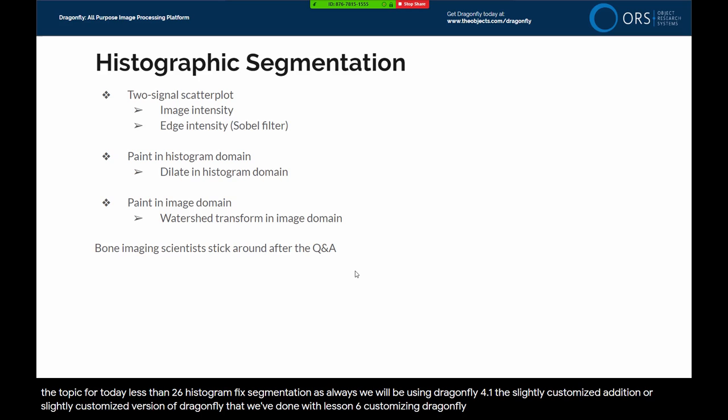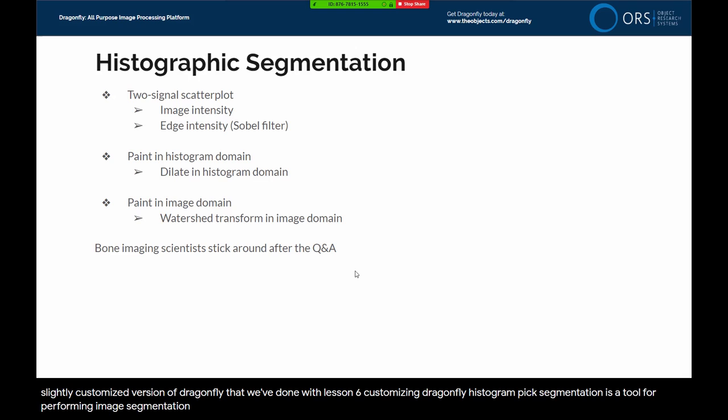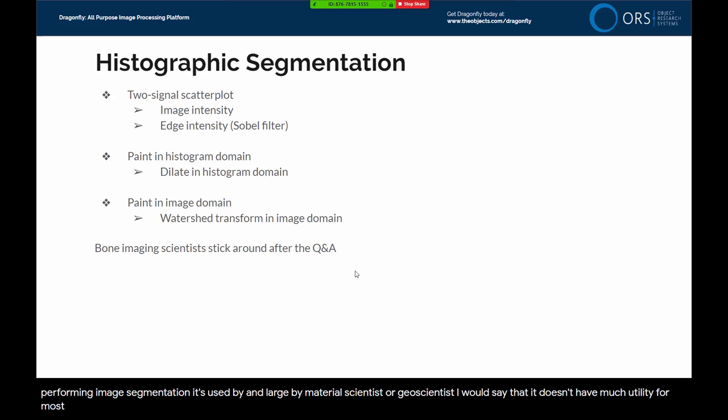Histographic segmentation is a tool for performing image segmentation. It's used largely by material scientists or geoscientists. It doesn't have much utility for most biological applications, but we'll have a look at it today and you can make a decision for yourself.